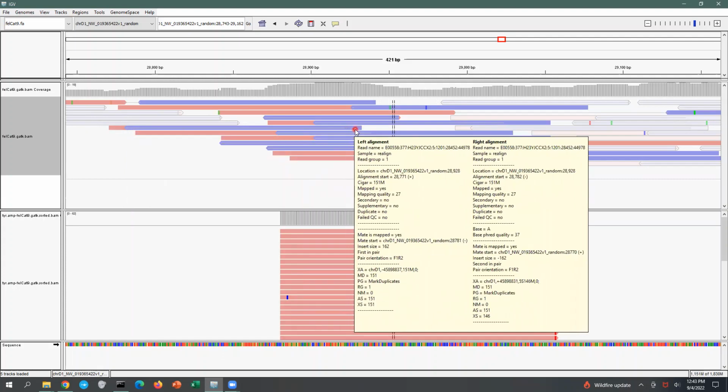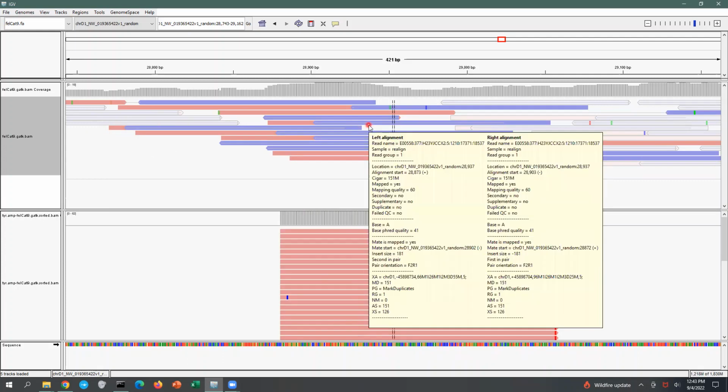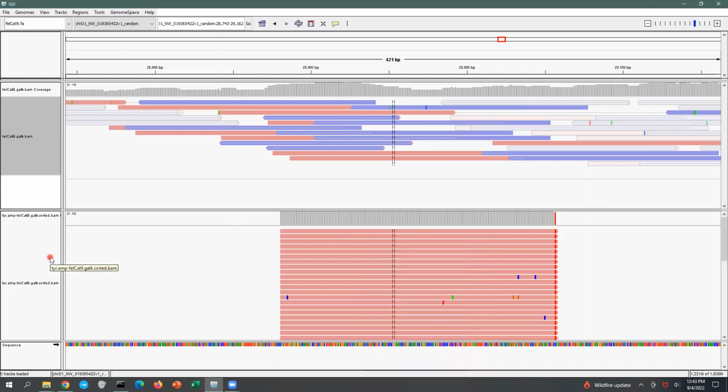Now the amplicon is somewhat like this fragment where you have primers for the ends of the sequence, and you can see that down here. This is the amplicon, and it's called an amplicon because you have those primers to amplify a particular sequence. And the sequence is sufficiently large that I believe they used a program, their own custom code, to merge those reads out of a fragment that looks kind of like this. And they provided me an intermediate form of data. So they did not provide me with the same type of raw data that I have for my whole genome sequencing, but I think it was still useful.